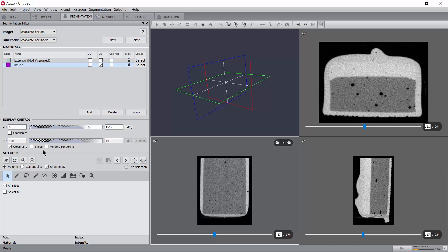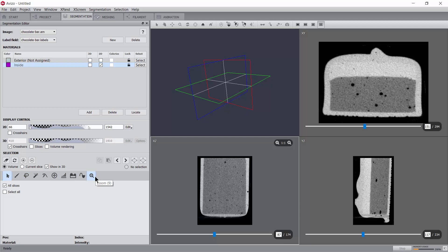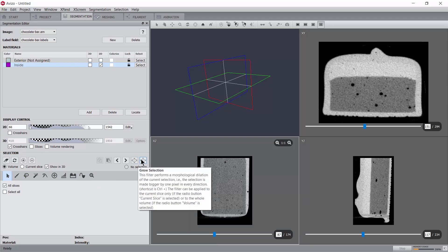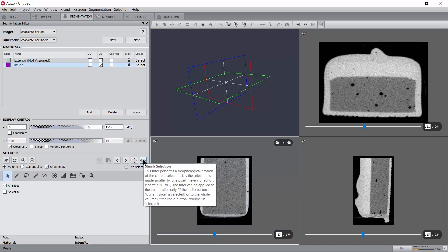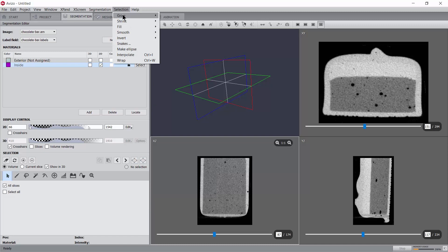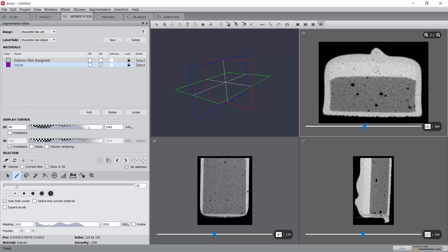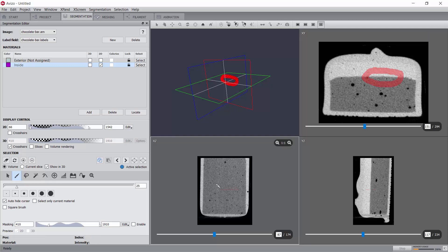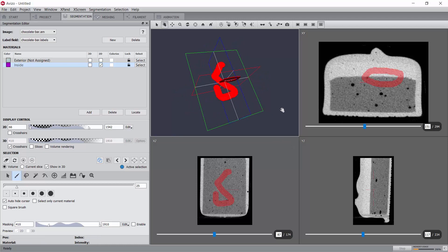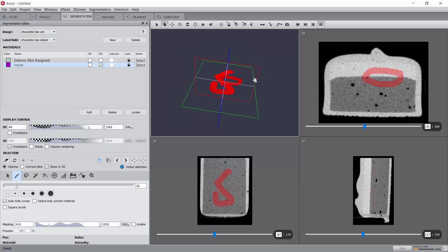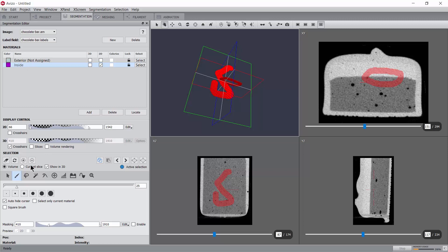The general principle of the segmentation editor is to first use selection tools to select some pixels, optionally modify that selection using the grow or shrink buttons or the selection menu, and finally assign that selection to a material. For instance, the paint tool allows you to select pixels directly by painting them on the 2D slices. Selected pixels are shown with a red overlay in the slice viewer and also in red in the 3D viewer. The assignment to a material is done by selecting the material and pressing the plus button. Let's just clear this selection for the moment and see how we can segment that data set.